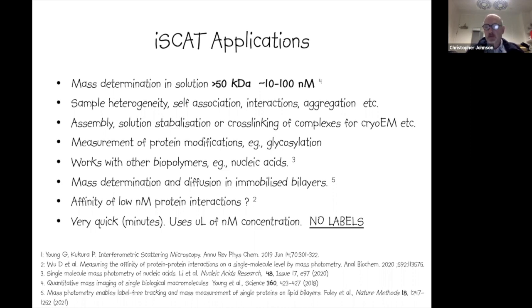And then on top of that, one could then consider adding in additional proteins and looking at how they interact with the initial protein that you've embedded in the bilayer. And there's a reference here, and there have been a few papers published using this approach. And so this is really quite interesting.